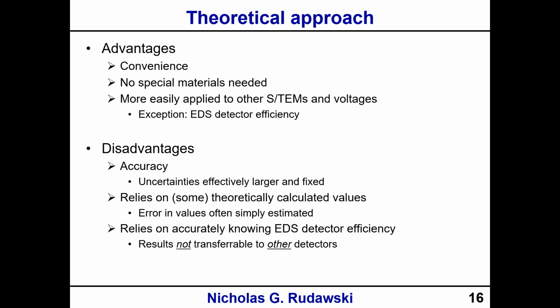And then we also need to know the detector efficiency curve very accurately, and this is not transferable to other detectors, okay? That's limited only to our specific detector that we're using on our specific STEM, okay?